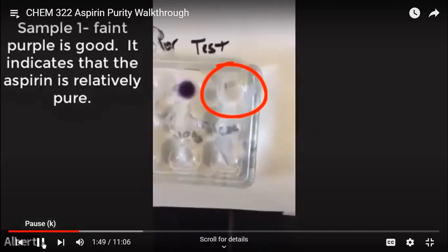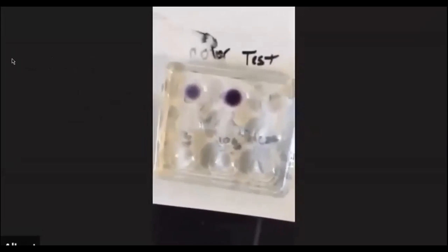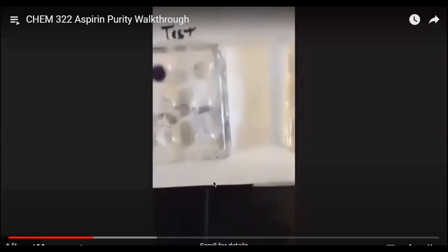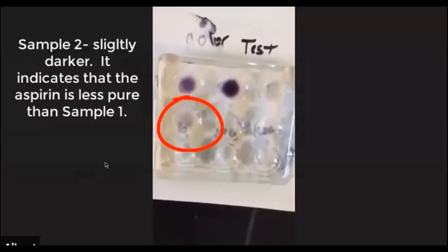All right. It didn't turn purple at all. It turned like a very... You have to purify it again. All right. I'm going to do 30. 30 got a little more purple in it. Can y'all see that? You see 30 on the left, second row on the left, compared to the last.